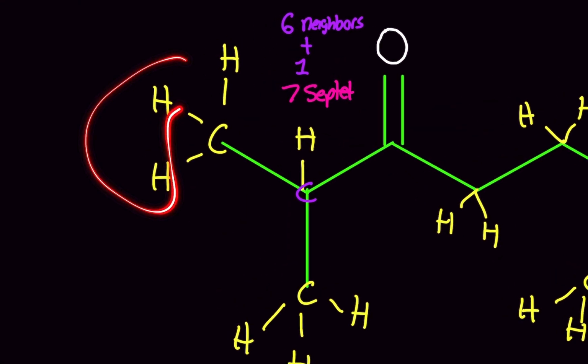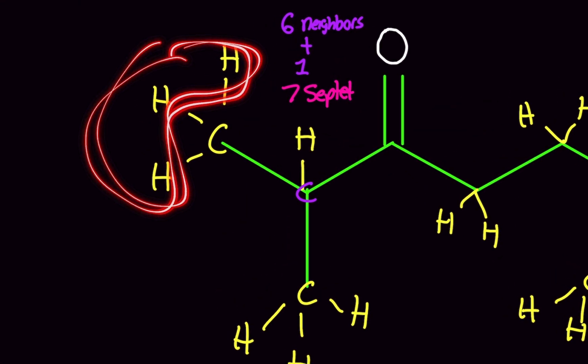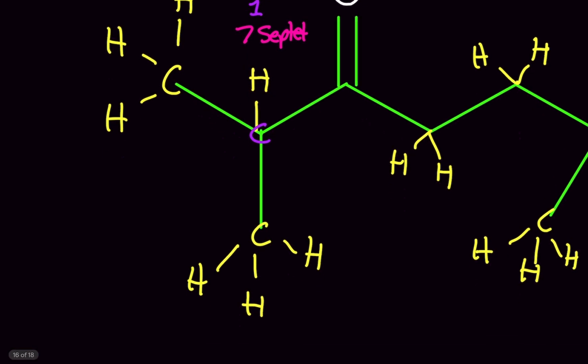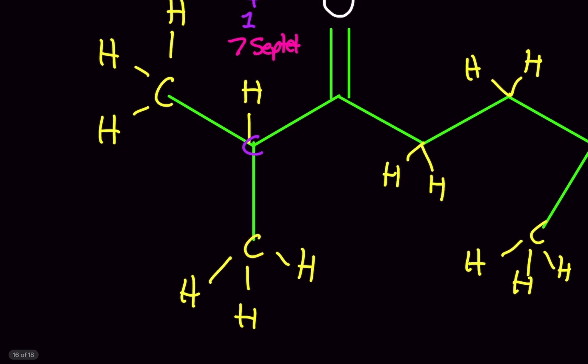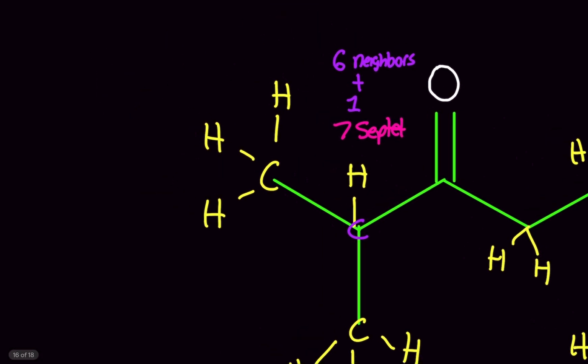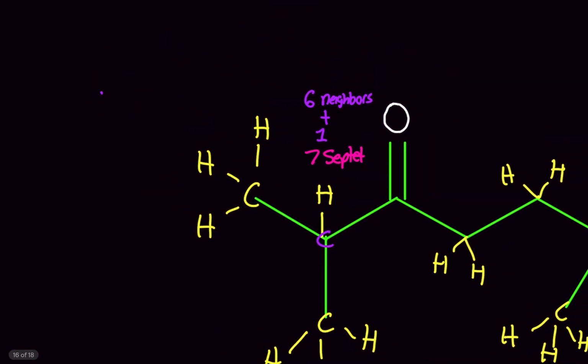This methyl group is all one environment that has 1 neighbor. And you'll notice that this carbon is too far away, right? Because we have a hydrogen here. So we go from 1 carbon, 2 carbons, 3 carbons. 3 carbons is too far away. We can only be within 2 carbons. So we go hop 1 and hop 2. So we only have 1 neighbor. So this signal right here has 1 neighbor.